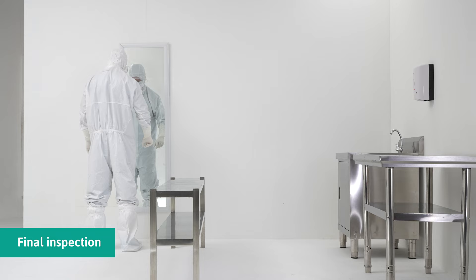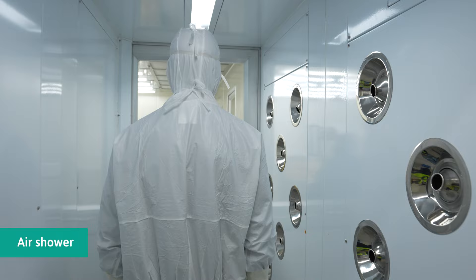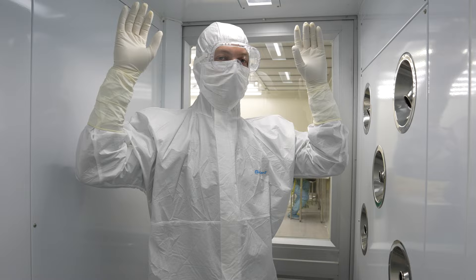Ensure all garments and accessories are correctly fastened and secured prior to entering the clean room. There should be no skin, hair, or inner garments exposed prior to entering the clean and aseptic area. The wearer must go through the air shower chamber. When the air shower begins blowing, the wearer shall rotate and lift their hands upwards to expose as much surface to the airflow as possible.